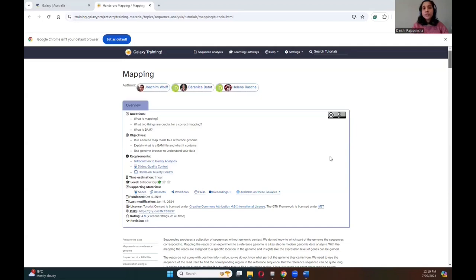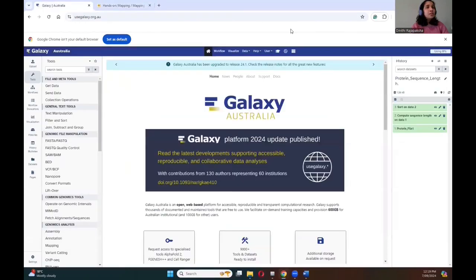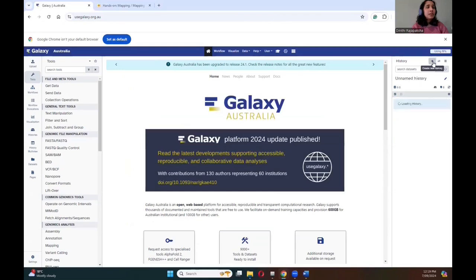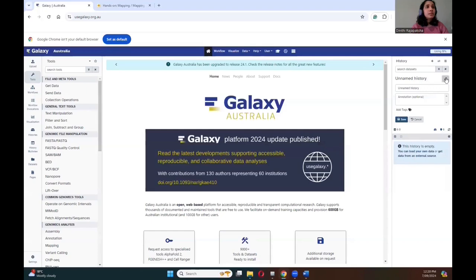For today's tutorial I'll be using the usegalaxy.au server. First we will create a new history in the history panel, create new history, and then let's rename the history. I'll rename mine as sequence mapping.